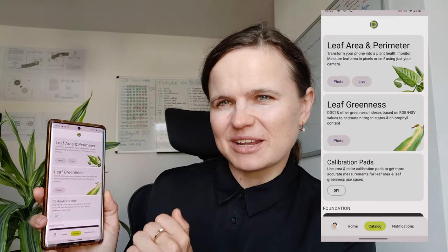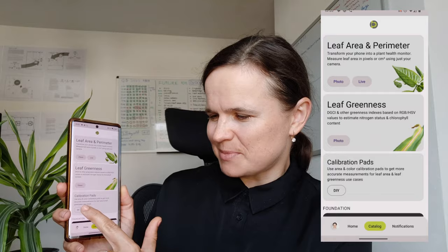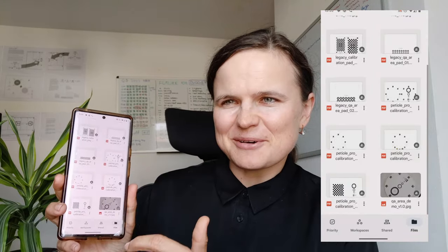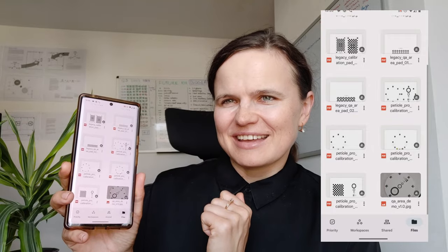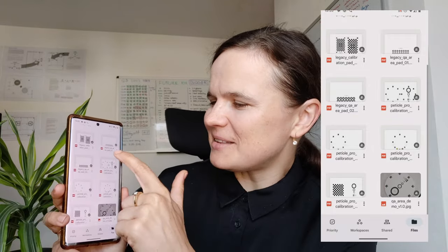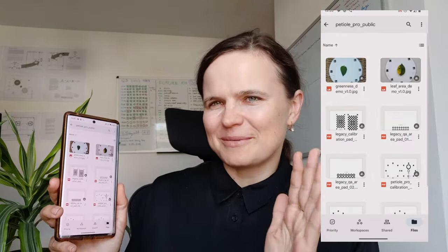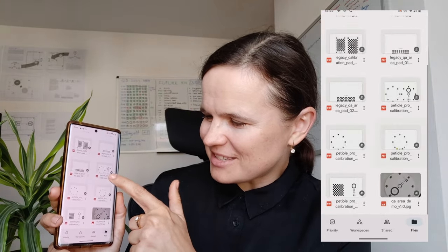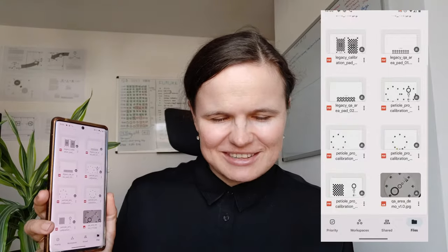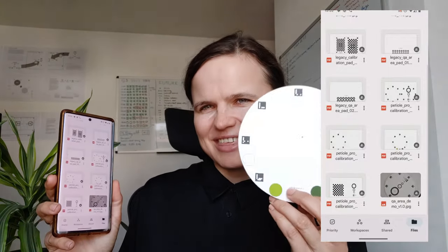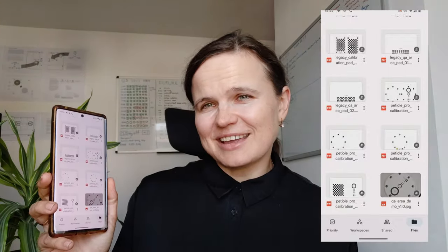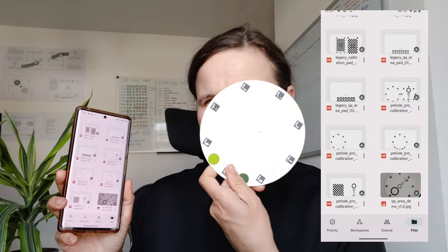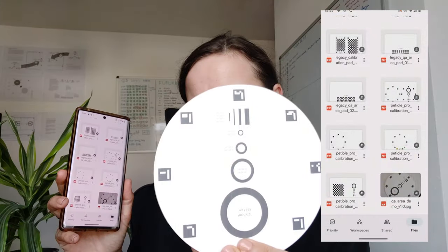The first step is to get the calibrating pad. You can see the calibration pad is available — just press the button and you can see a selection of different calibrating pads. Your task is to find the Petiole Pro calibration pad, which looks like this. Please find it and print it out. You will find two sides — this one and this one.